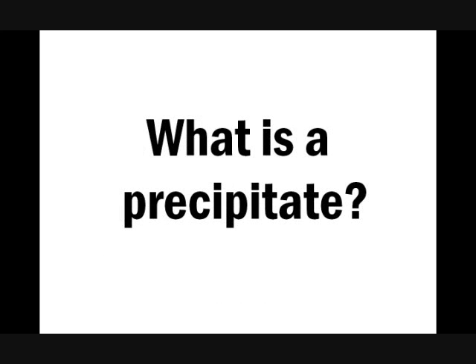Precipitate is a solid formed when two liquids or aqueous solutions react. When two ions form a compound having low solubility, a precipitate will form due to the mixing of the two ions. Once the solution has dissolved the maximum amount of solute it can dissolve, which is called a saturated solution, the excess solute will pile up to form a solid called a precipitate. When there is a precipitate present, it means that the saturation level of the solution has surpassed its maximum.